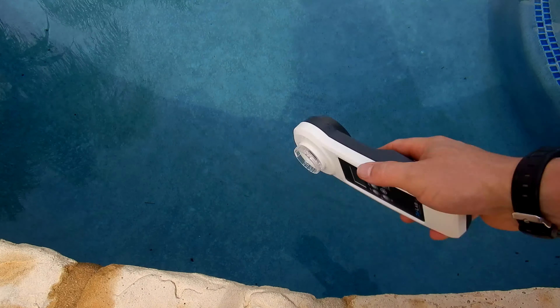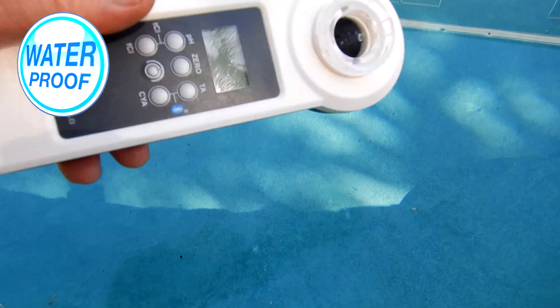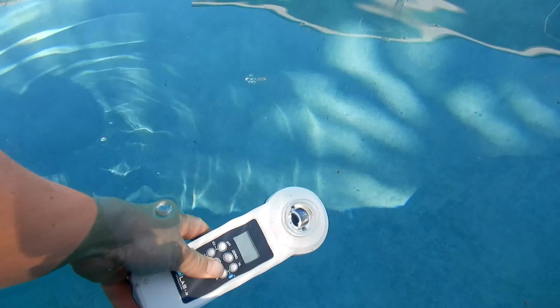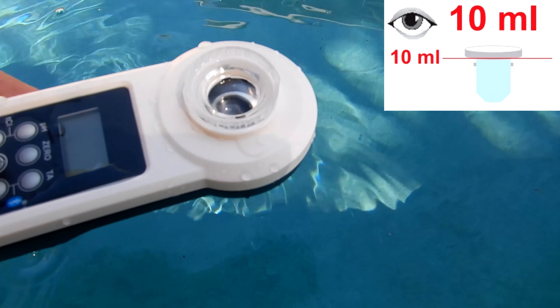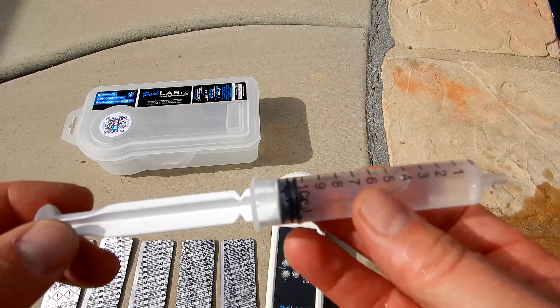First you want to make sure the unit is clean. Go ahead and dip it in the pool and rinse it. The PoolLab 1.0 is completely waterproof so you can actually dip it in the pool to get the 10 milliliter sample of water. Just shake off any excess water until you're at the 10 milliliter mark. If you choose, you can also use a syringe to get the 10 milliliter sample.